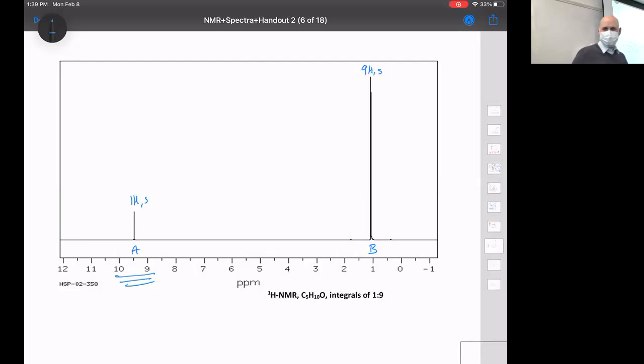All right, so we don't always see these 9H peaks, but hopefully logically you guys in Zoom got to this. If you see a 6H, it's 2 CH3s. See a 9H, it's 3 CH3s. They're all identical and they're all next to a carbon with no H's. So most likely, and in this case, definitely, since you only have 5 carbons in the molecule, they're all next to the same carbon. So this is all environment B.